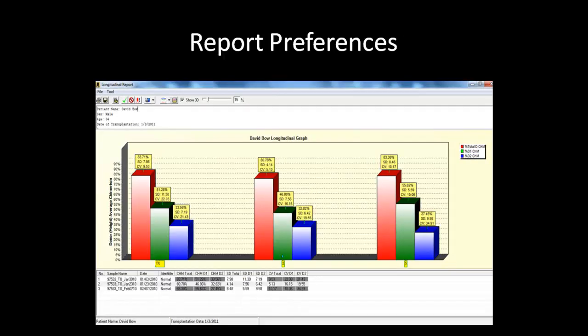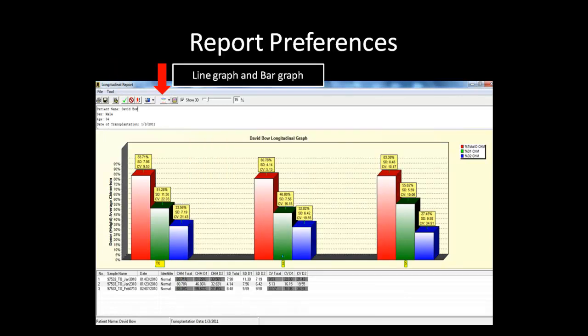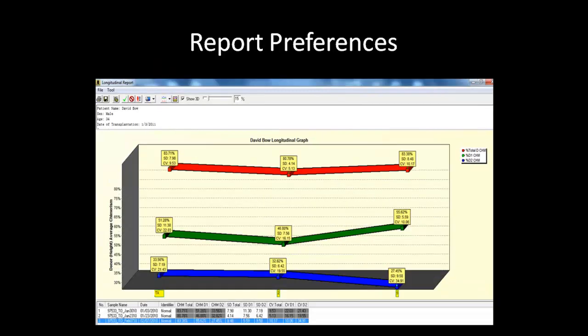Before saving or printing the report, you can specify the viewing preferences for the graph by going to the longitudinal report preference settings. In this dialog box, you can select which information is displayed in the graph, how the dates are displayed, chart layers, and what information will be saved with the report. You can also use this icon to switch between a bar graph and a line graph. This is what the report looks like in the 3D line graph view.